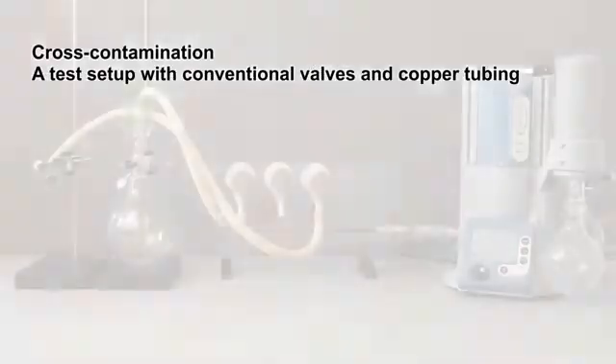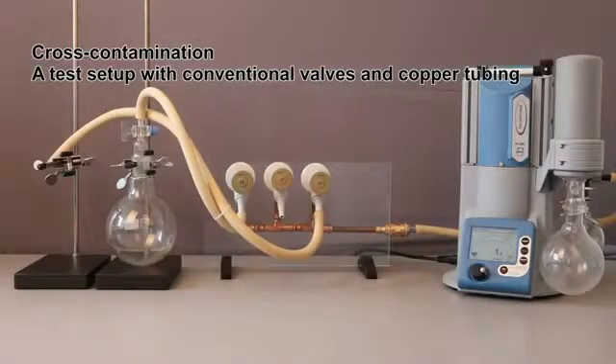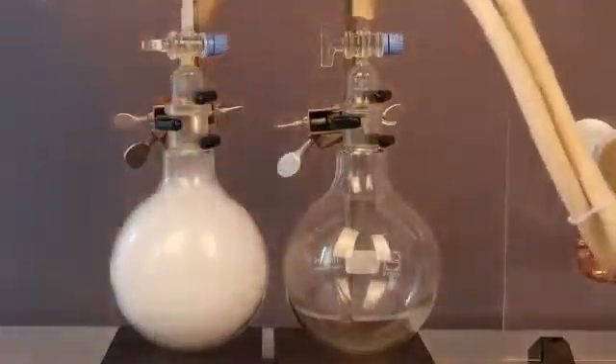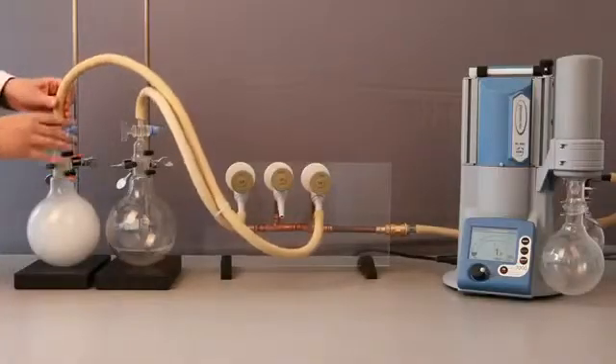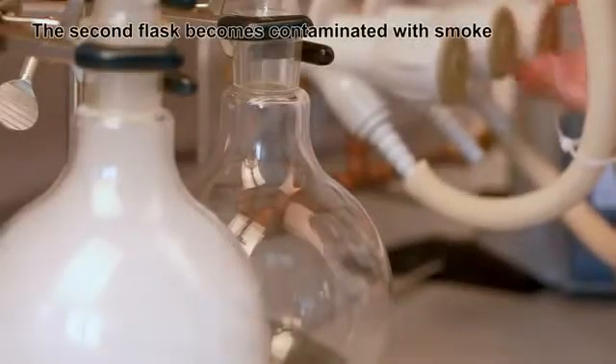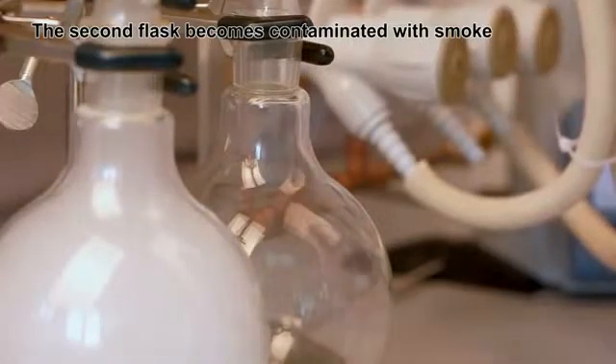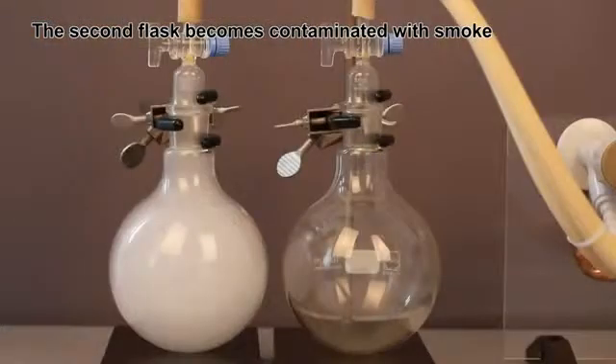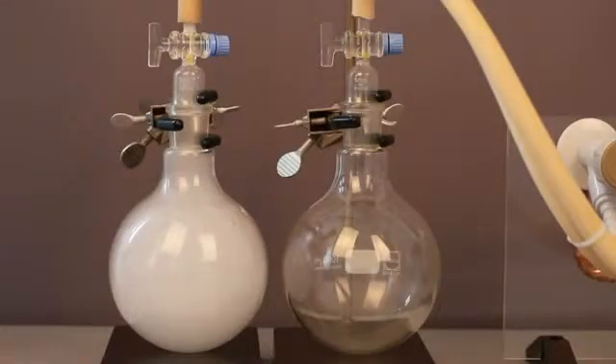A test setup using conventional valves and copper tubing. On vacuum networks running multiple applications simultaneously, users can get massive problems if the applications influence each other. In this test setup, an additional flask filled with smoke is brought into the vacuum network. The existing flask is already under vacuum. When the valve is opened, you see that the second flask becomes contaminated with smoke.